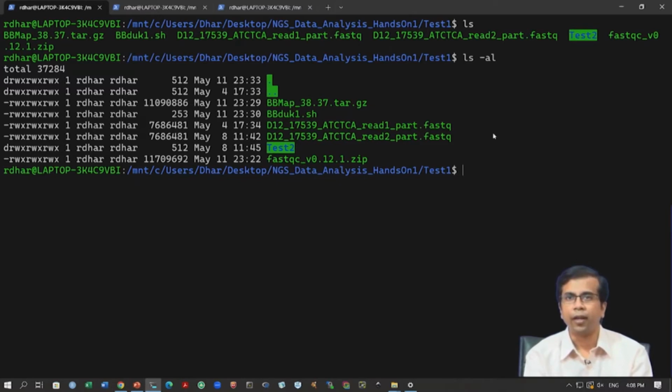As we have discussed, the fastq files, the data generated from the Illumina platform, are actually huge in size, really big, because you have millions of reads in there. If you want to do all these analyses with that kind of data set, we will not be able to complete this hands on within a reasonable period of time, because all the steps will take a long time to complete.